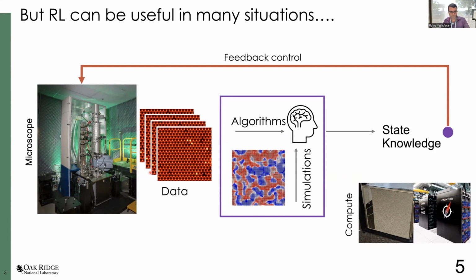But I just want you to get from this slide that a lot of what we are doing, particularly when we are trying to manipulate matter using the microscope, can be deconstructed into a simple reinforcement learning problem. It's simple in the sense that it is easy to formulate. It is difficult, however, in the sense that it is very challenging to solve using most traditional means. And so I'll talk to you about some ways that you can go about solving some of these problems today.